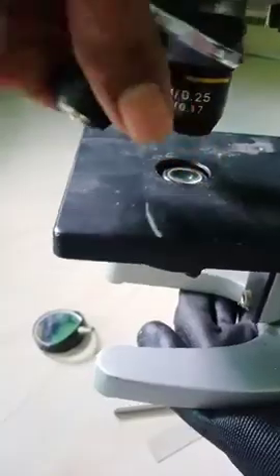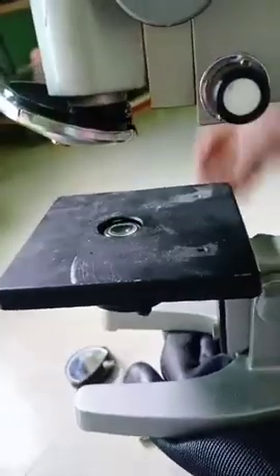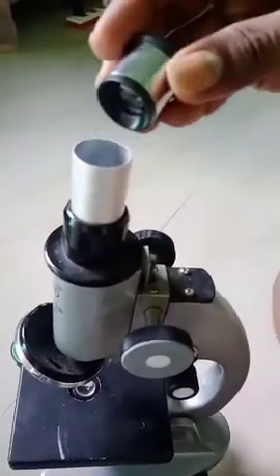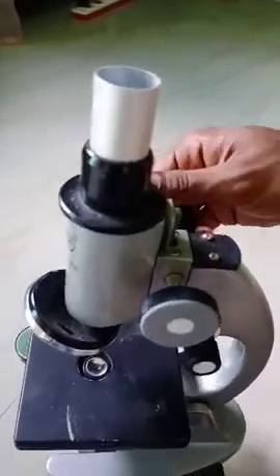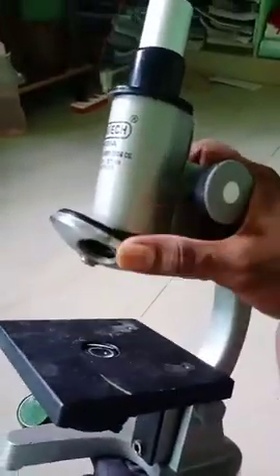Even we can dismantle these objective lenses. Even we can dismantle the diaphragm, but we need a screwdriver. Now we are not going to dismantle it. We can dismantle this cylinder and nose piece also.